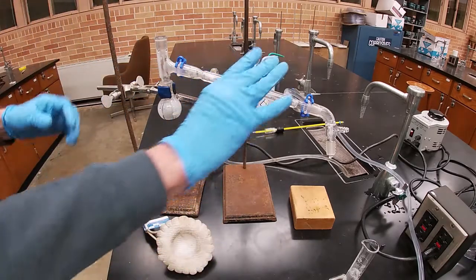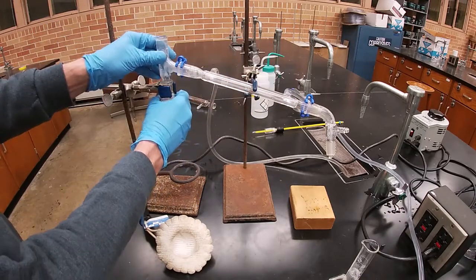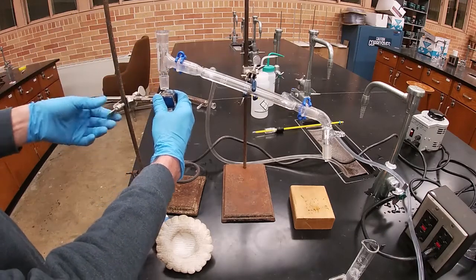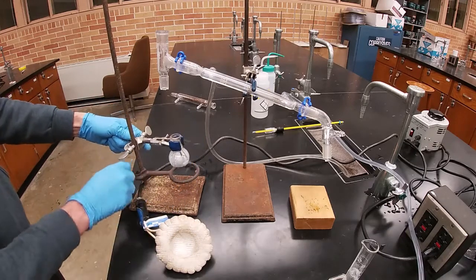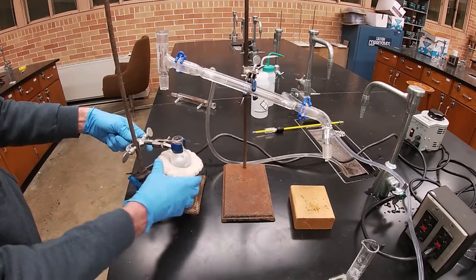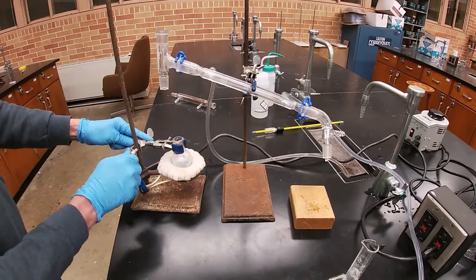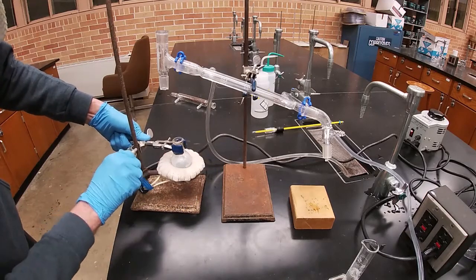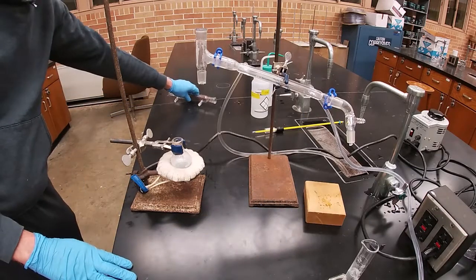Okay, now this is fairly secure, and I'm going to separate it and lower the round bottom flask. Okay, now again, set this up down here. Whoops, pretty low. This is a fairly tall apparatus. Okay, now again, it's not the ring clamp that's important, it's the round bottom flask that must be secure. Now here's where it's more important to be plumb and level.